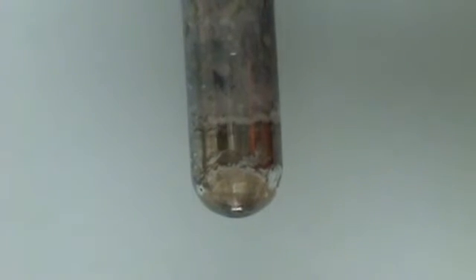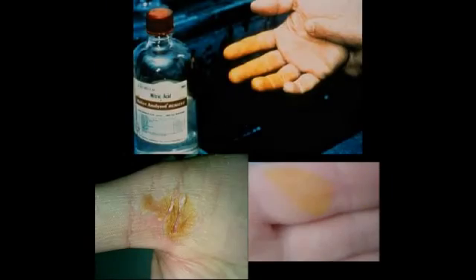After you make the silver mirror, you will be using nitric acid to remove the silver mirror off the bottom of the test tube. Nitric acid turns proteins yellow, which includes your skin. Please be very careful. The stain will last for a week or 2.